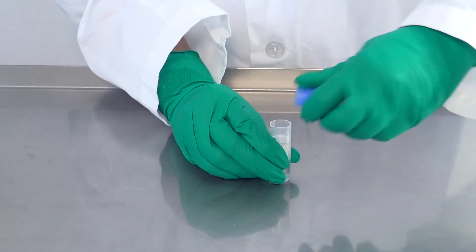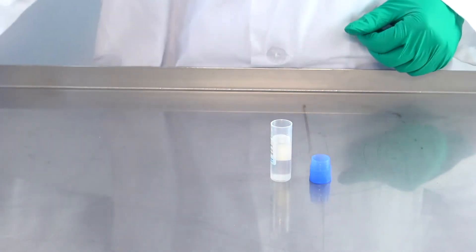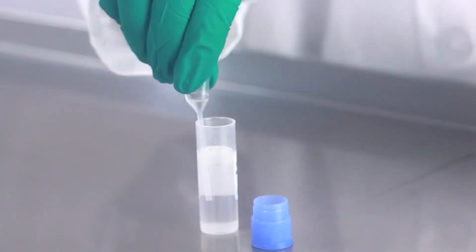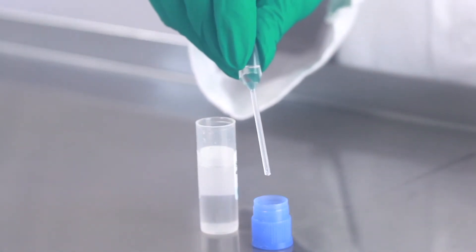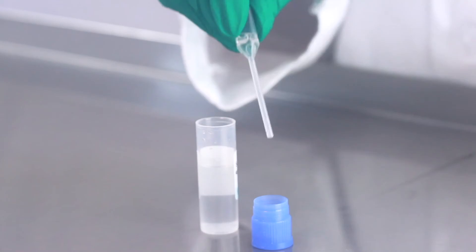Then open the dilution vial and place the blue cap upside down on a clean surface. Using a new disposable plastic pipette, add 10 drops from the dilution vial to the blue cap.